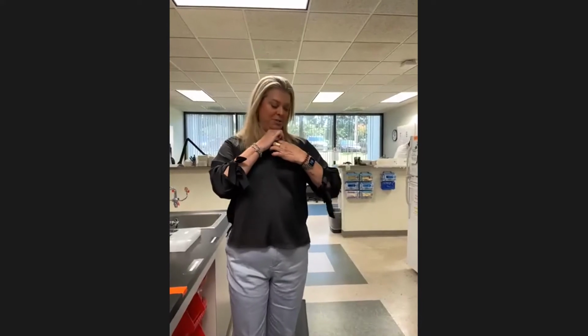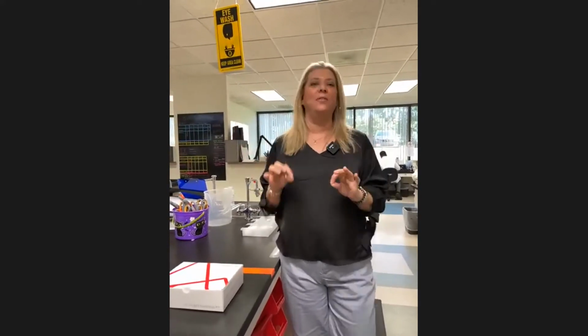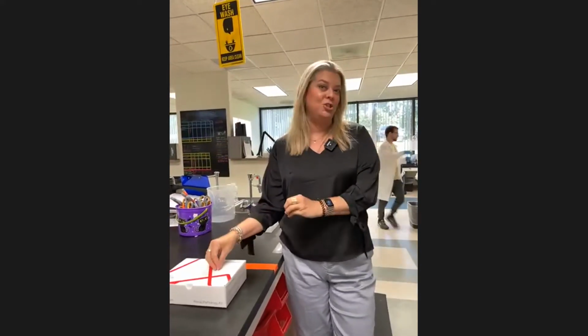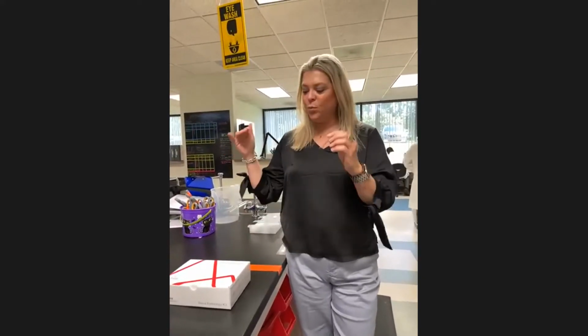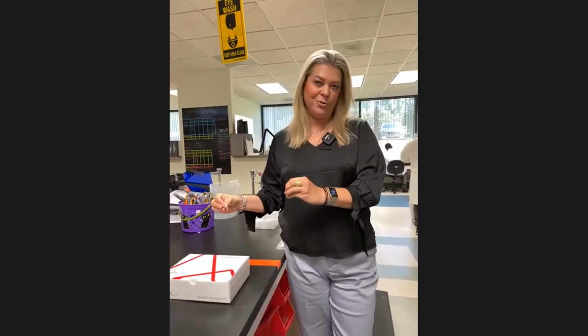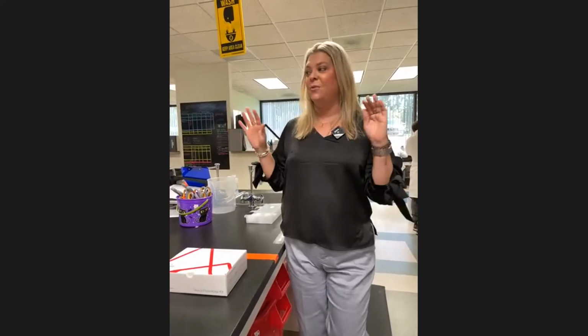So yeah, the grossing, like he said, it can kind of be gross. They'll talk about all the areas, all the things that your tissue looks like: if it's straight, if it's curled up, if it's bloody, whatever. So they are really documenting every single thing that they see when they take that tissue out of the bottle, just again, for your safety and making sure that we know exactly what arrived here in our laboratory when we first opened the case that morning. So that's grossing and accessioning.